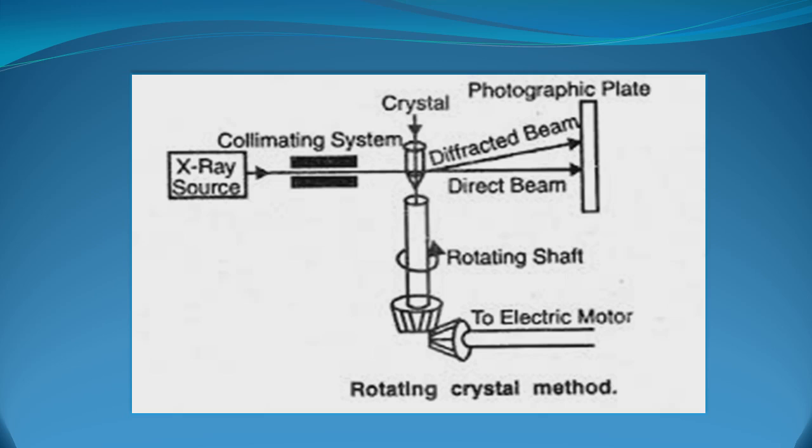There is a difference between the direct beam and the diffracted beam. This difference makes a clear image of the sample, its internal structure and the position of the lattice points, and there are numerous applications of this method. We can also digitize the photographic plate in order to analyze the various applications of that sample.